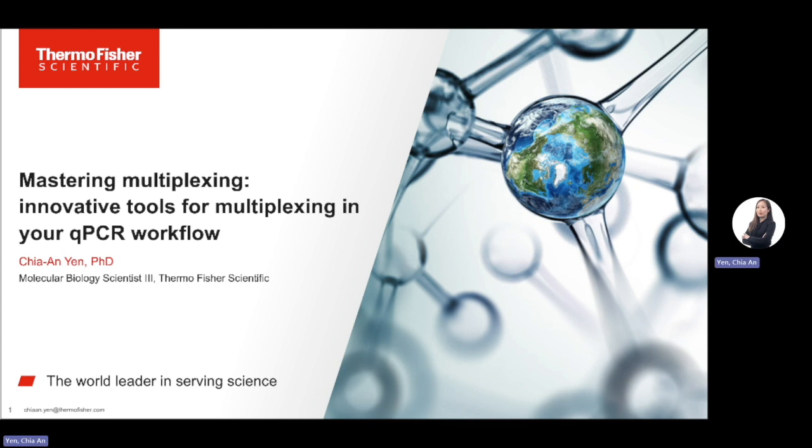Hi, everyone. Thank you for joining us today. I'm excited to talk to you about multiplexing and qPCR. This is a subject that is of great importance to the progress of research and development in many different fields, including that of the private and nonprofit sectors, and particularly important for molecular diagnostics and biopharma R&D fields.